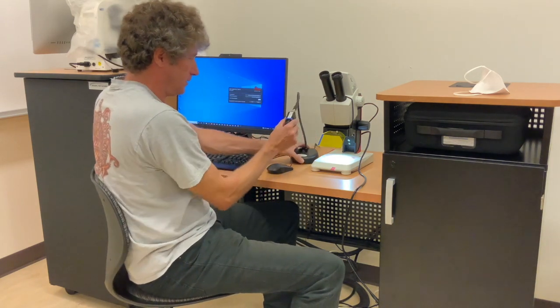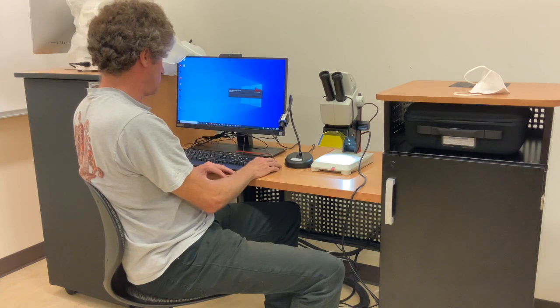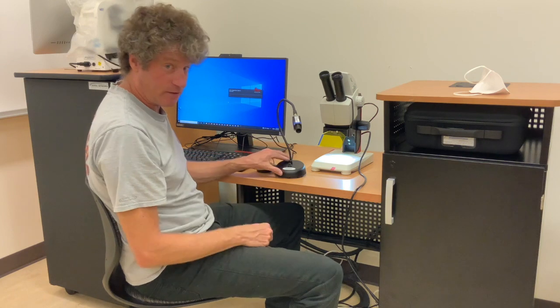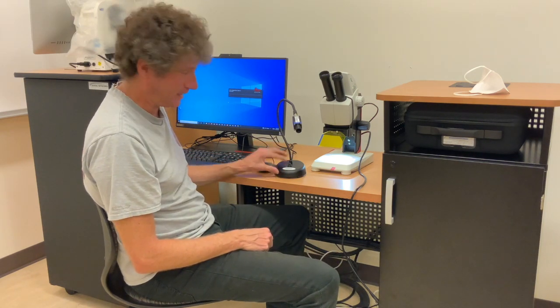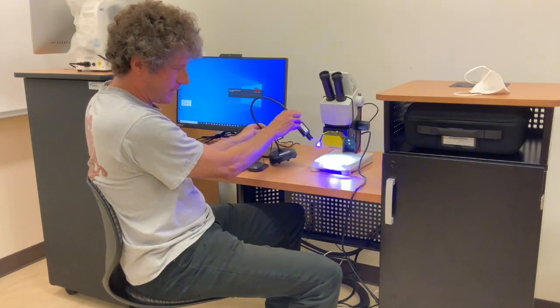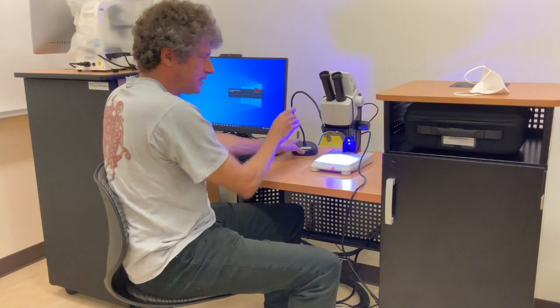If you want to turn on the light here, it comes on at the end — it's very bright, but it's not ultraviolet, though it might sort of hurt. It's LED. Click on the button here and you can see this blue light coming out, and you shine that on the top of the sample.